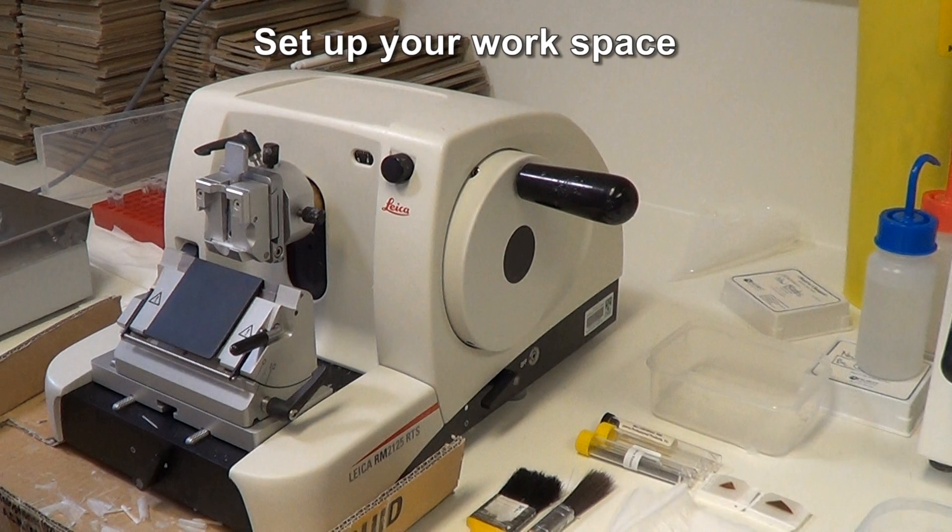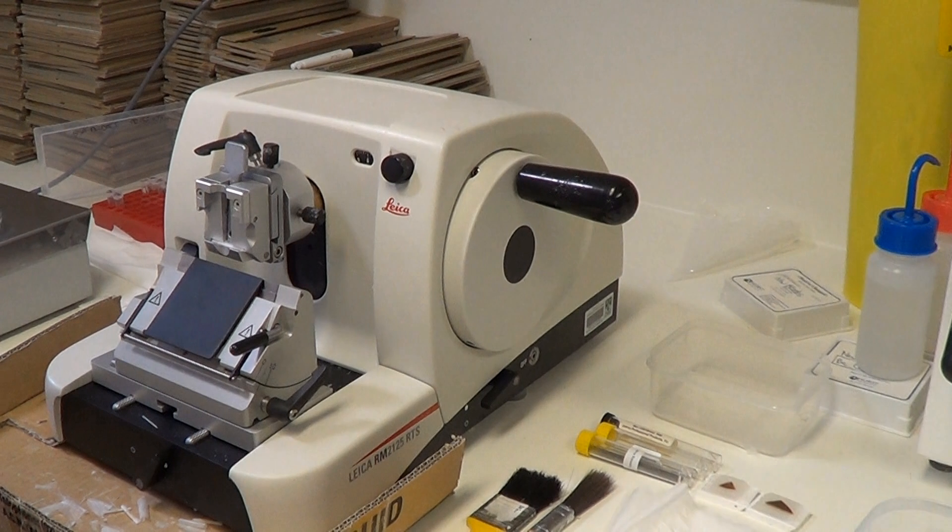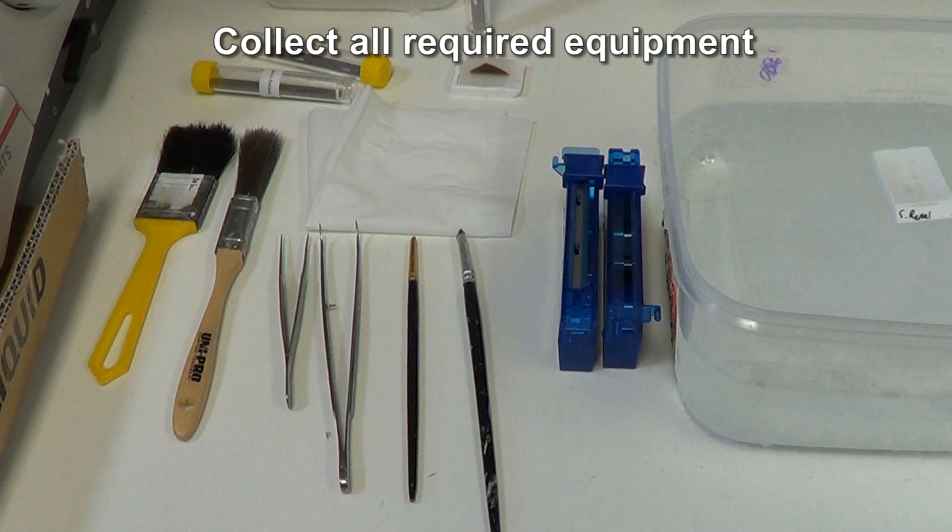Microtome safety. Wear the required personal protective equipment. Set up your workspace. Inspect the area for loose knives. All knives must be kept in appropriate containers. Do not leave the knives lying on the bench. Collect all required equipment before starting.